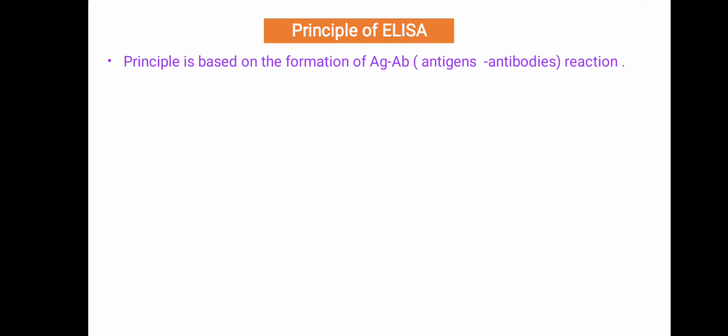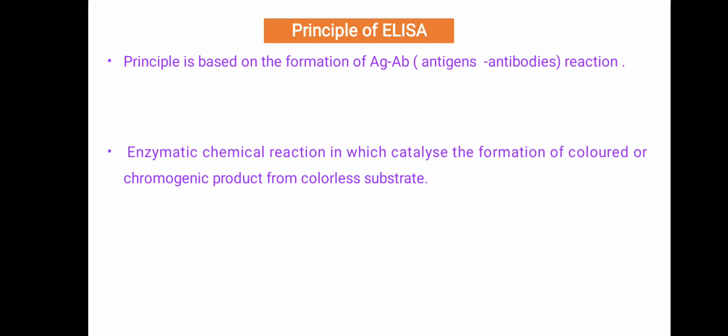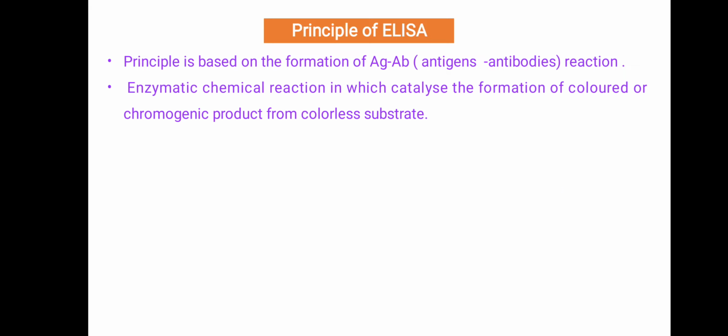Principle of ELISA. The principle is based on the formation of an antigen-antibody reaction. It is an enzymatic chemical reaction which catalyzes the formation of a colored or chromogenic product from a colorless substrate.